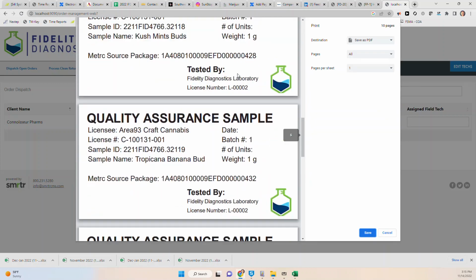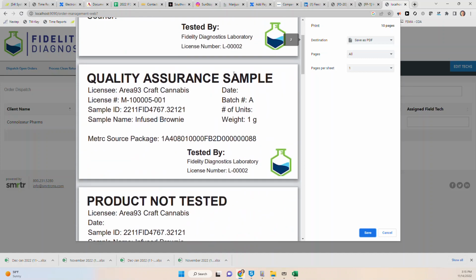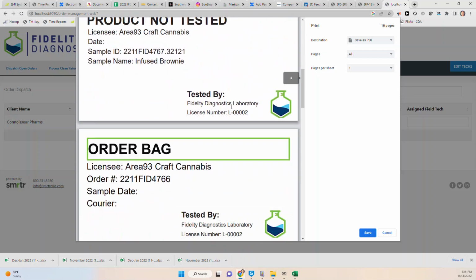and this is currently set up to be printed on a roll-fed printer, but you could print it differently if you like. And that's one of the reasons that the box is here as well, so that visually the user can see where the breakpoints are.